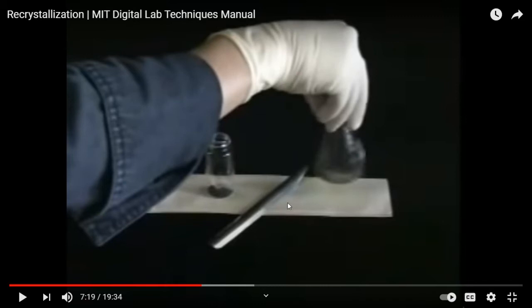Remember these things. How do you remove colored material? Charcoal. That's not enough, okay? That's a simple memorization. You gotta put some description, the principle. Charcoal, using that nonpolar surface, high surface area, has a London force with the colored compound, as well as our main compound.